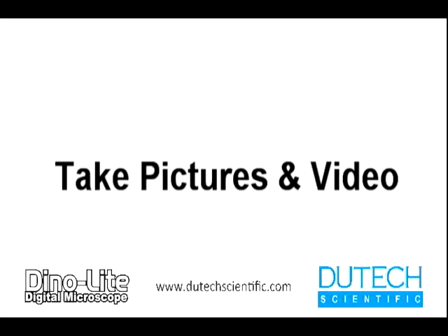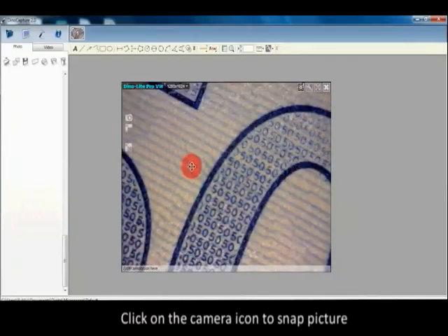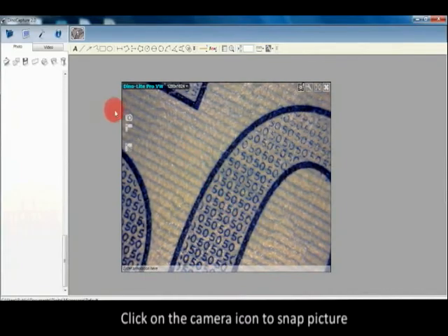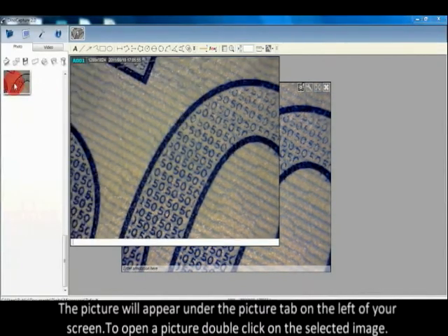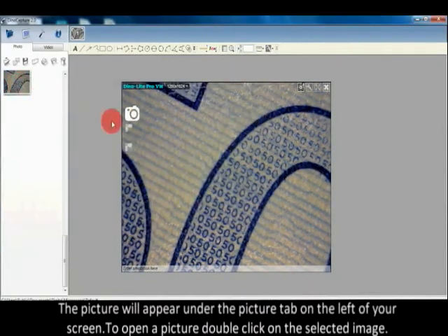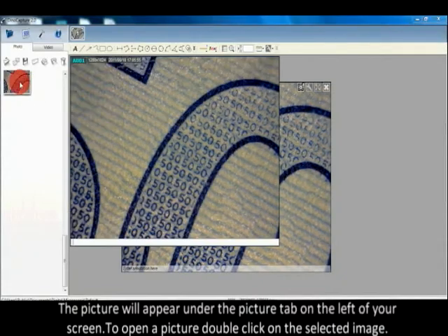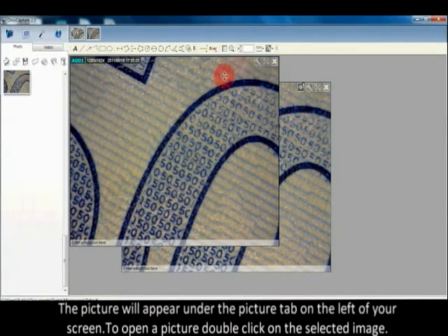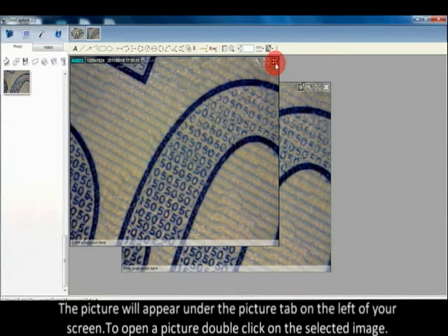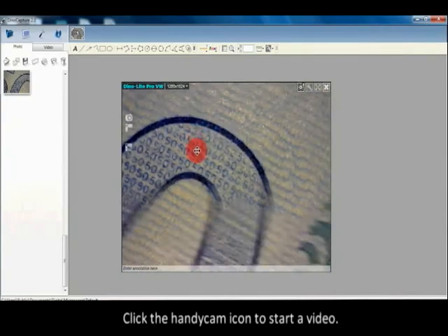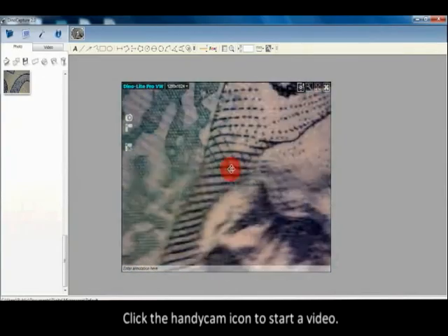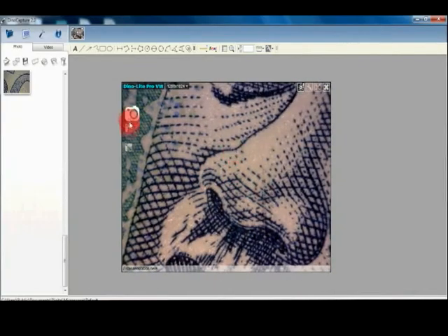Click on the camera icon to snap a picture. The picture will appear under the picture tab on the left of your screen. To open a picture, double-click on the selected image.